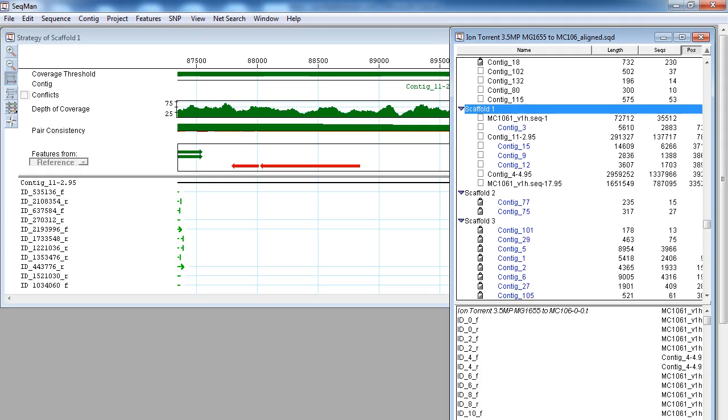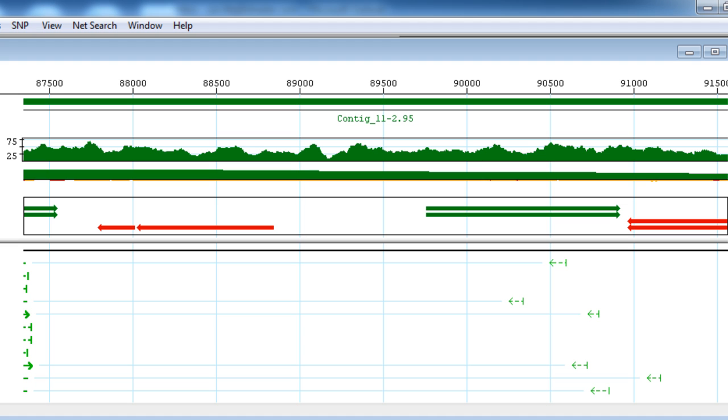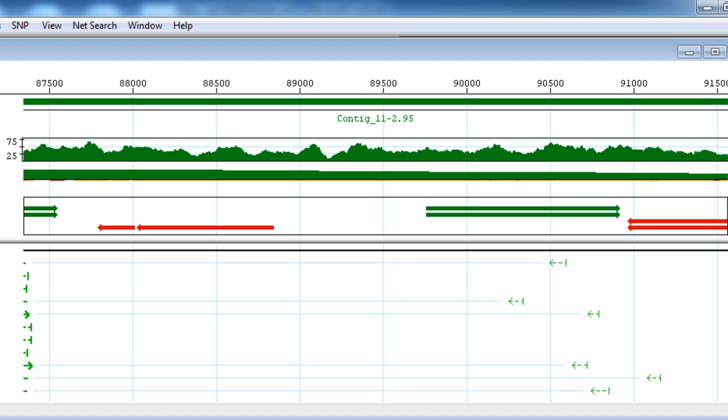If we look at the strategy view, we can see how moving those 3 low coverage contigs into the unlocated contigs group has allowed these 2 larger contigs to merge. You can see that the arrows have now turned green, indicating paired reads that are now joined in a single contig.